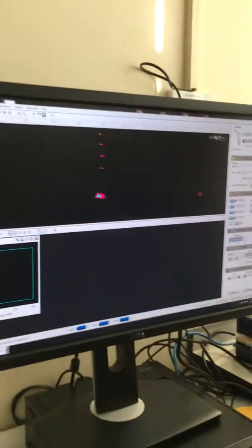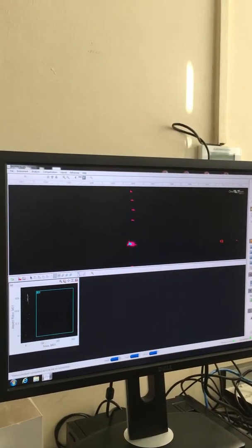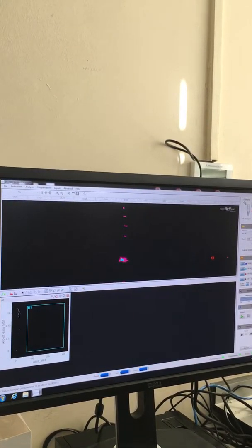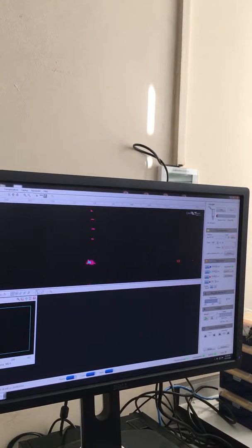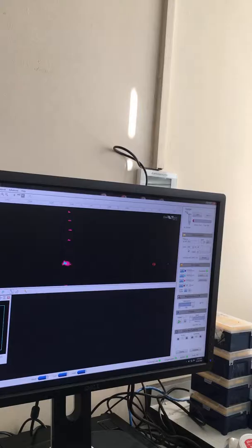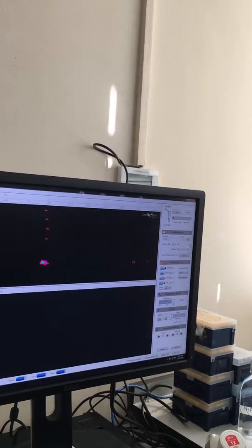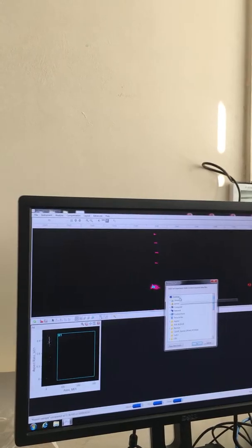You need to do a few things now. You need to name the file that you want to save next. What's this one? ISO APC. Or maybe call it AF466. Okay, so remove APC from the name. Remove the space as well, I think. There we go. Then hit open the folder and pick the folder you want to save it into, which is ASA.